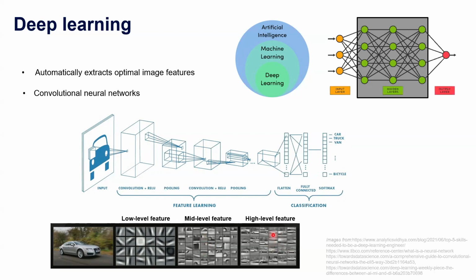So after we give lots of input images like this and get the model trained, and the model can generate these complex feature maps, then it can aggregate all this information to make some sort of predictions about the input image. So that's how deep learning is done.